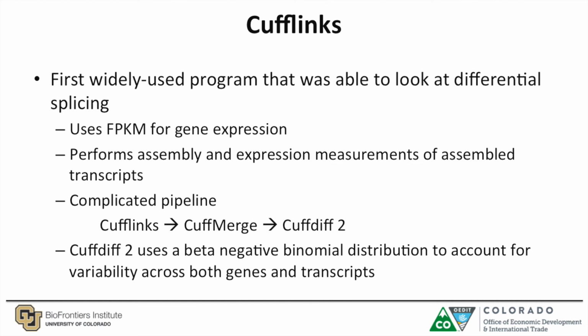The second program we're going to be using is Cufflinks. Cufflinks is actually quite different from DESeq. It actually looks at differential splicing, and it was the first widely used program that was able to look at differential splicing. There are other programs that have been coming out that are able to do this, but Cufflinks remains one of the easiest to use.